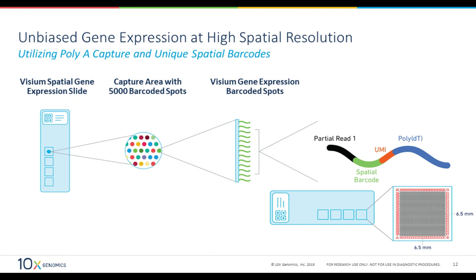but they're used in image registration, so that when you take the image and you pair the sequencing data on top, the sequencing data basically finds its way to the right spot on the slide based off of where the image is taken and how those fiducials show up in image analysis. So it's basically guiding the sequencing data to the right guideposts so that it maps perfectly onto the slide. And so all it is, is a way for us to very accurately map the gene expression data onto the image data.